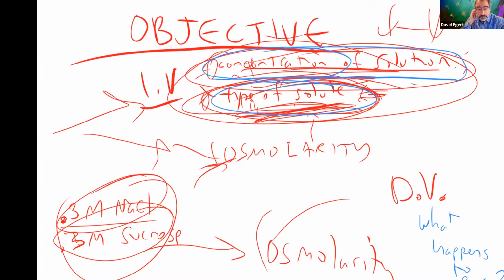All right. That being said, test tubes. Number one, distilled water. This one cracks me up, to see how creative people get with the osmolarity and everything with this test tube.